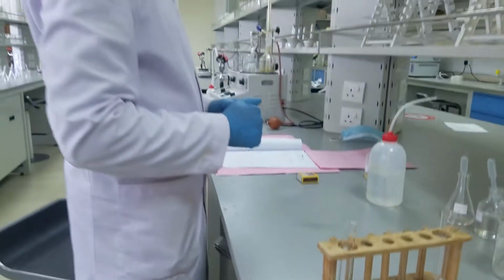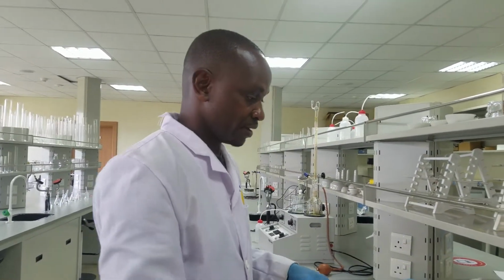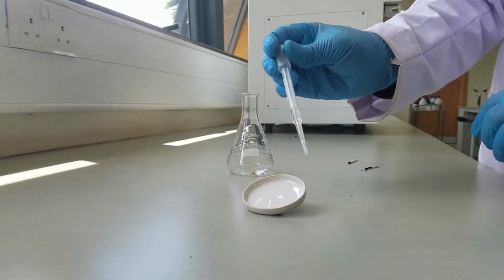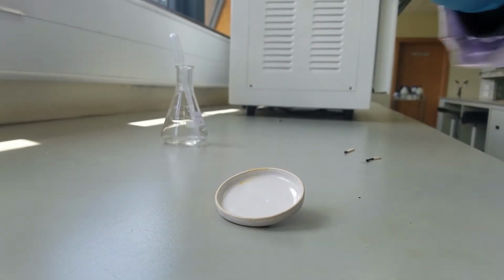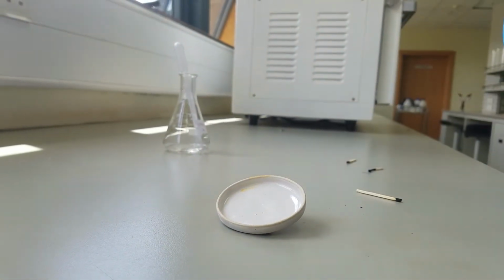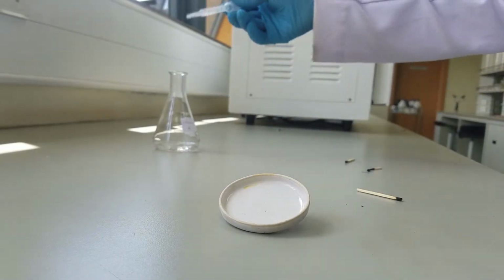Okay. Then the next experiment I'm going to do is combustion for the same. I'll take my unknown and go back to the other side so that we also burn it. You should be able to identify it. I'm going to pick a small amount of our unknown like that, and then we burn it and try to relate. Oh, sorry, it's not burning yet. I'll add more, just a little bit.